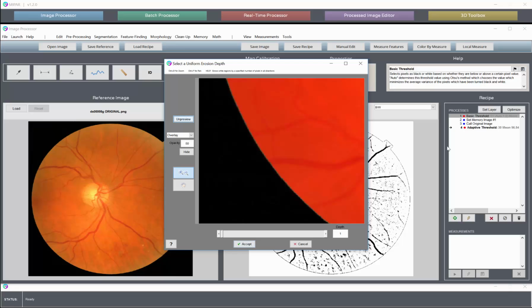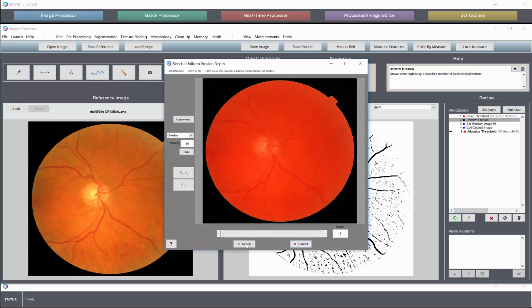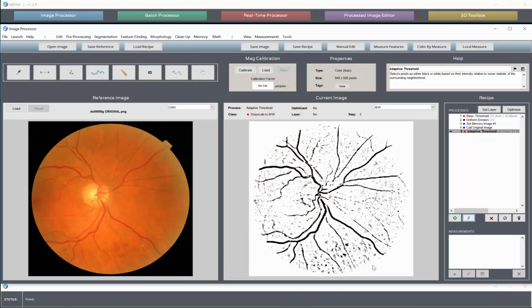And if I hit accept now, then we're taken care of. Maybe I should bump it up to 2. And now that perimeter noise is gone without having to erase back to any previous step. So that is a case of using a memory step to feed into another step as a mask.